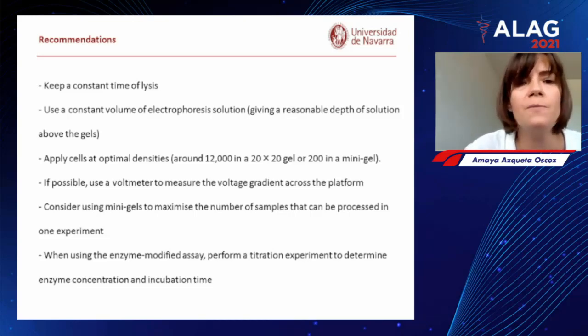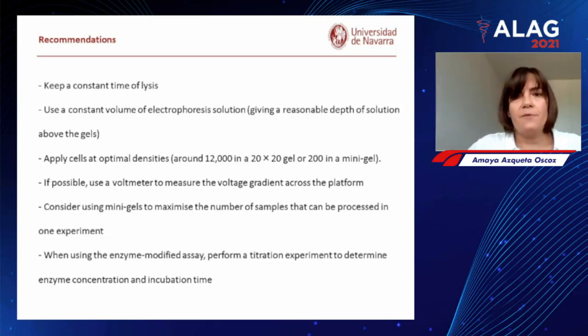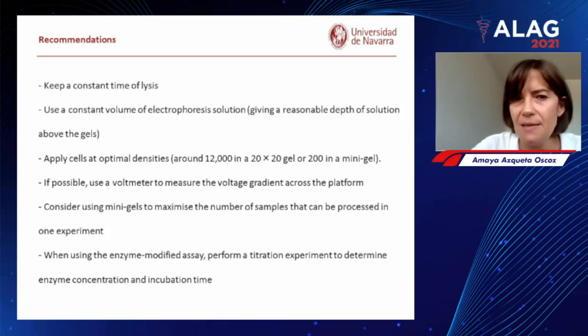Then use a constant volume of the electrophoresis solution, of course giving a reasonable depth of solution over the gel. And this is important. We normally take a lot of care about the milliamperes, but that's not important anymore. As long as you reach the voltage you want, the milliamperes are not important. So just keep a constant volume of electrophoresis solution in all the experiments within a set of experiments.